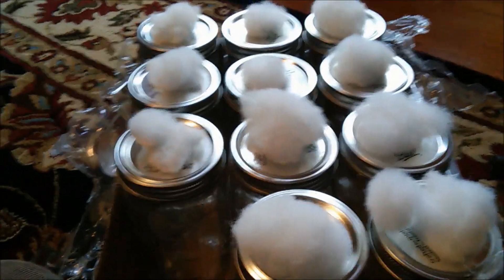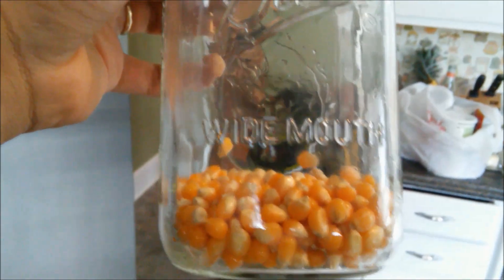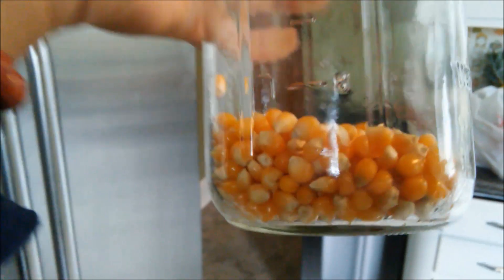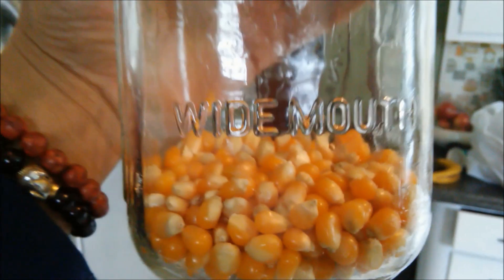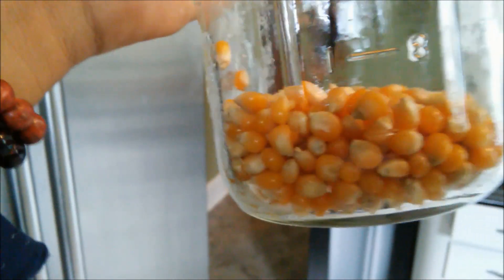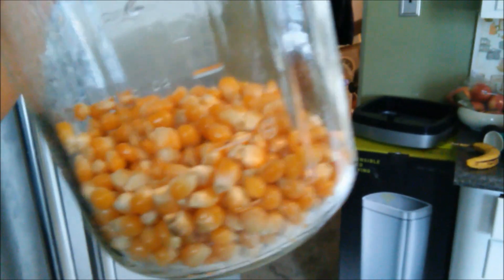Now we're going to fill these with corn and prepare to pressure cook. We have our jars a quarter of the way filled with corn. One pound of corn will fill four quart jars halfway. We like to start ours with only a quarter to allow for fast colonization and to keep away any contaminants. Then we'll use it for grain-to-grain inoculation or grain transfers.